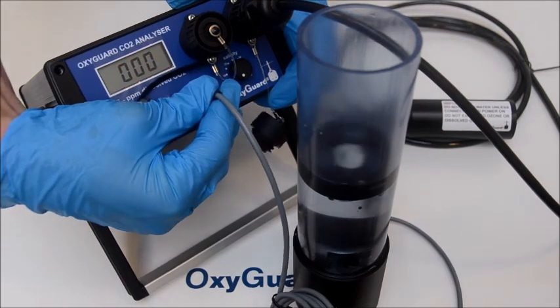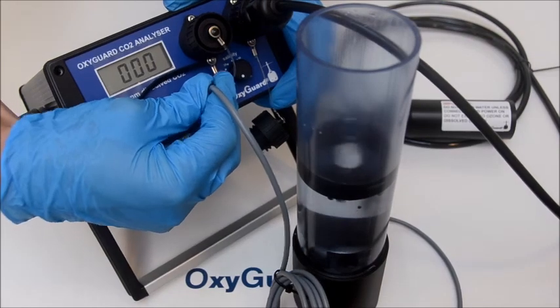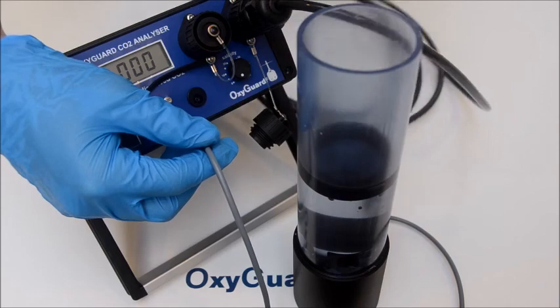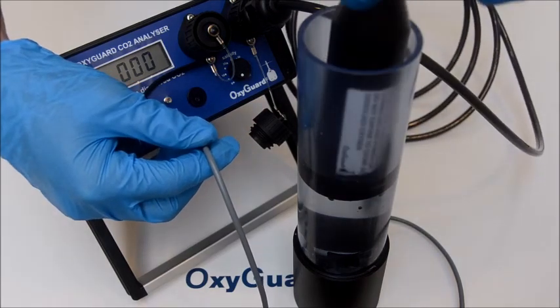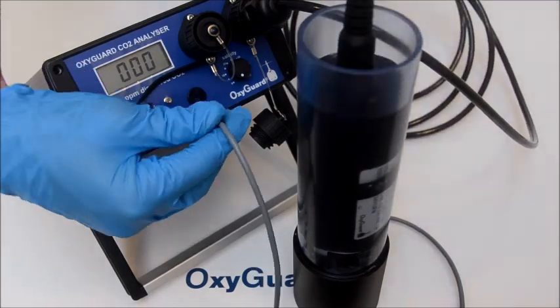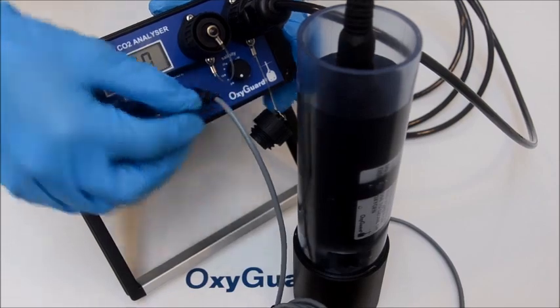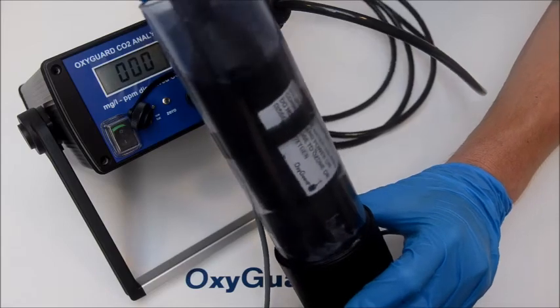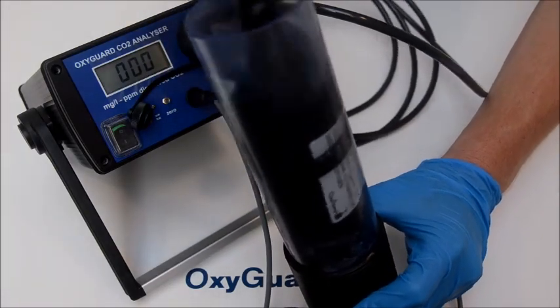Stop the stirrer, place the probe in the beaker, and start the stirrer again. Make sure that there are no bubbles under the probe. When the reading is stable after about five minutes, write down the value. You will need this value later.